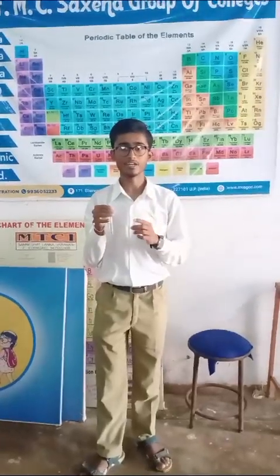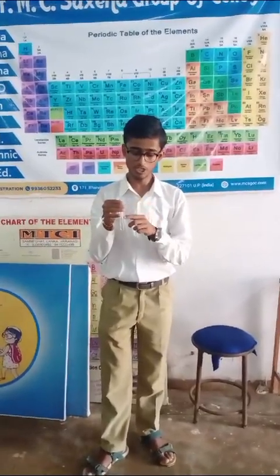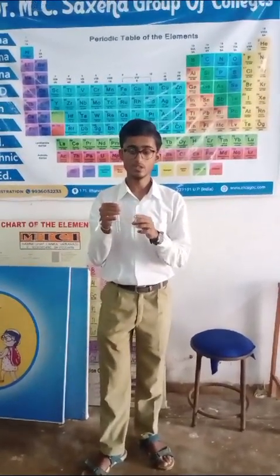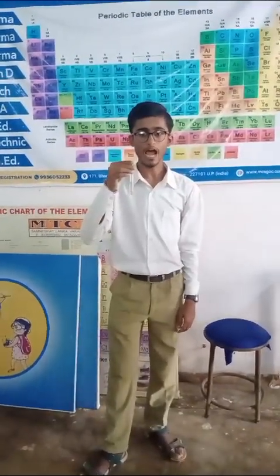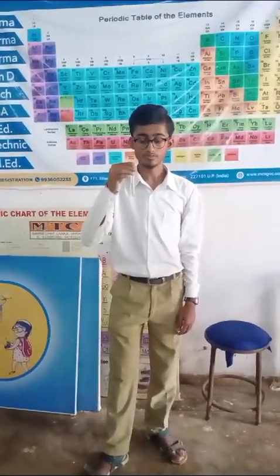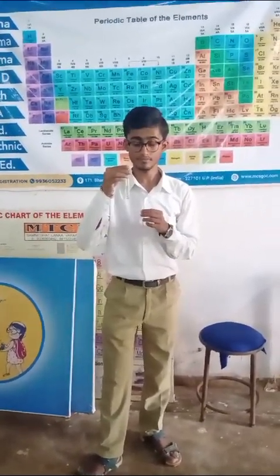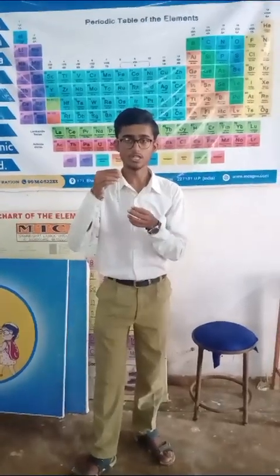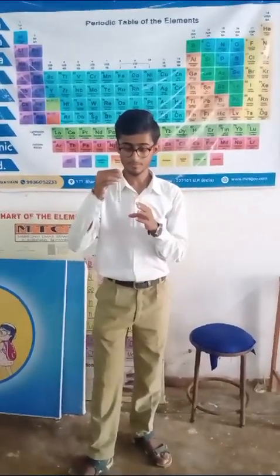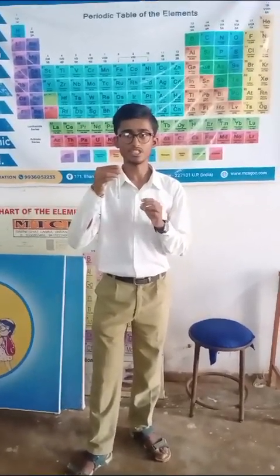Then I mixed the ferrous ammonium sulphate solution into the original solution. And with the help of a dropper, I added concentrated H₂SO₄ into the original solution, due to which a ring was formed between the two solutions. This ring is called Iron(II) Nitrosyl Sulphate, also known as the brown ring compound.